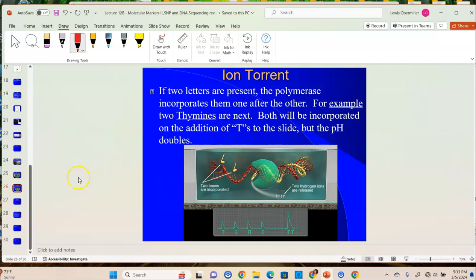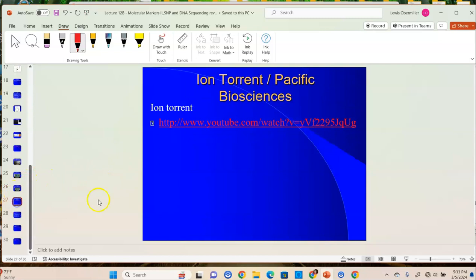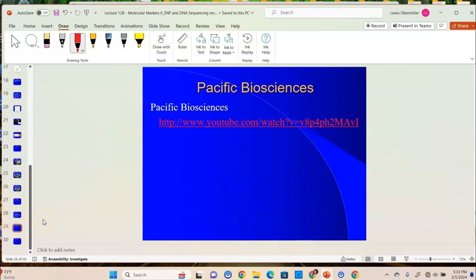And so this is a little faster. I know ASU has an ion torrent there. I'm not going to go through the whole thing. You guys can watch it if you want.